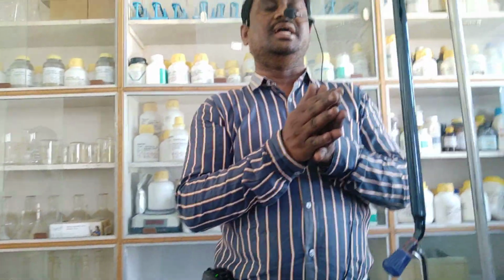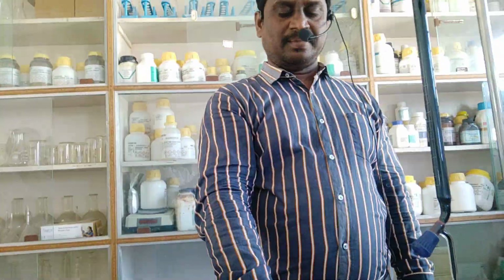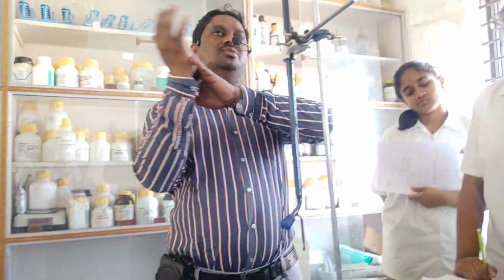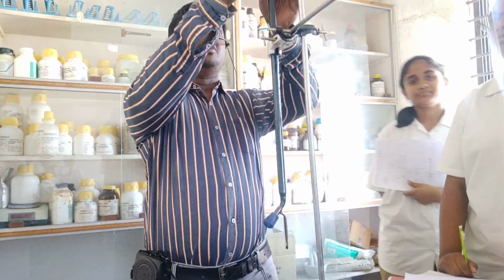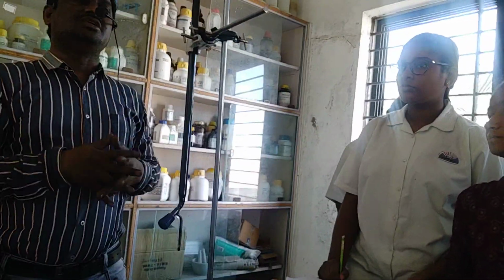And look here, M1 we have to find. We are doing this experiment to find the molarity of KMnO4. So M1 is the question mark. V1 we have already got now. We have done 3 experiments, so for V1 you take the mean reading. And M2 we already know: this solution we prepared manually. This is 0.1 molarity FAS, and V2 is the 10 ml I have taken in the pipette.